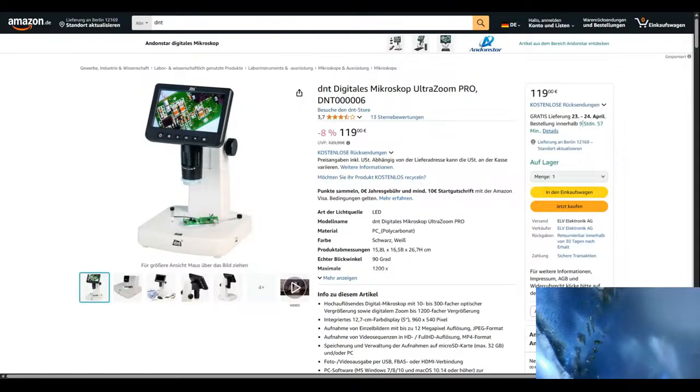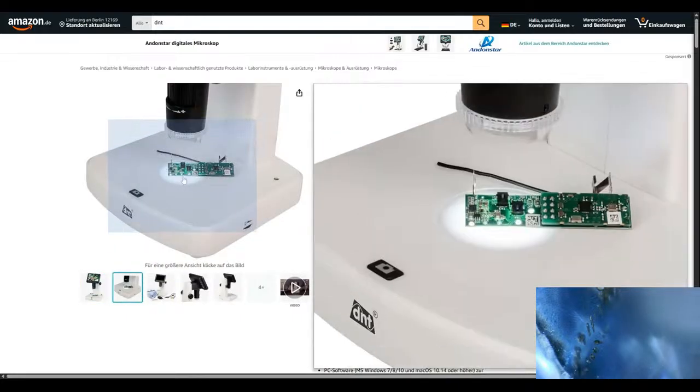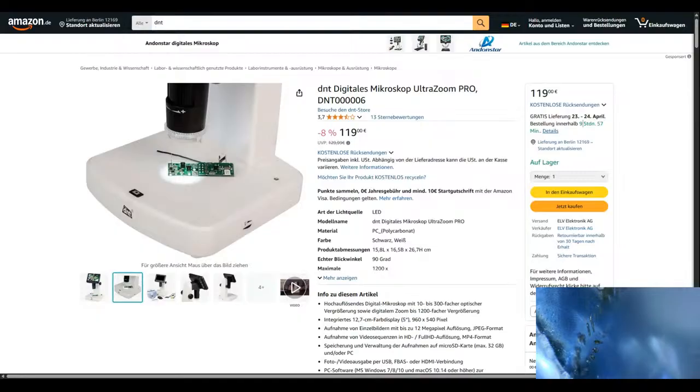Yeah, and the dark field creates light around the inclusions. The bright field is more of a straight through the stone, and the dark field tries to create light around the ring. It's basically the ring with a black spot in the middle, an opaque spot. It makes the inclusions show up in a totally different way. It makes them more visible, yeah, kind of, or definitely.